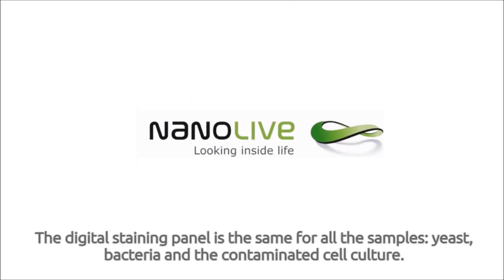The digital staining panel is the same for all the samples: yeast, bacteria, and the contaminated cell culture.